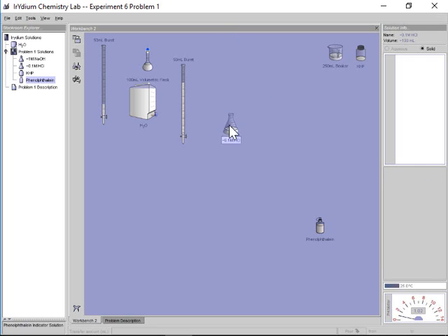And now what I want to do is a titration between my diluted NaOH, which is now roughly in the same ballpark as the 0.1 molar HCl, so now they're closer. I should be using roughly the same amount. I'm hoping for the titration volume to be something more than 10, so that I can pick up one more sig fig. Right now, this HCl container is telling me I have some 100 milliliters. Even though this is unknown, I don't need to destroy the entire sample. In fact, I'm just going to take a small portion. The fancy name for that is called an aliquot.